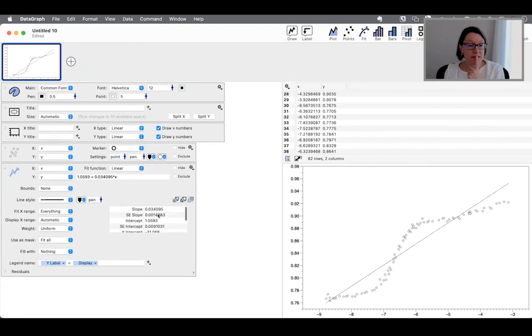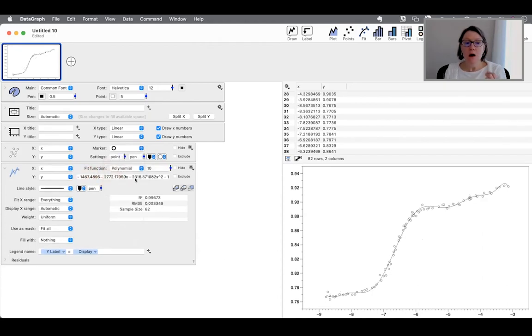Actually, on all of these, I take that back. I was thinking, in the old version, we had a slider here where you would change the number of digits. And we've removed that now for all the fits. So what is happening is you're getting, not just for the polynomial, but for these other fits as well, the digits that you see reported are the number of digits that you would need to reproduce this line.